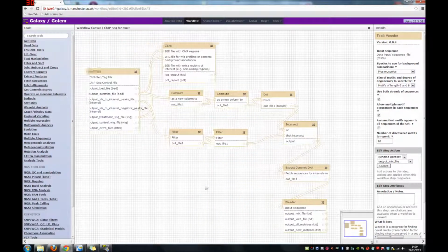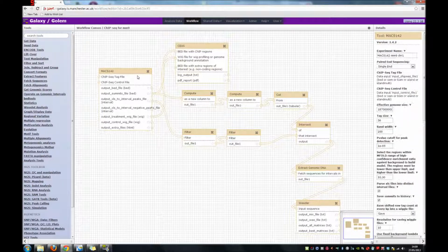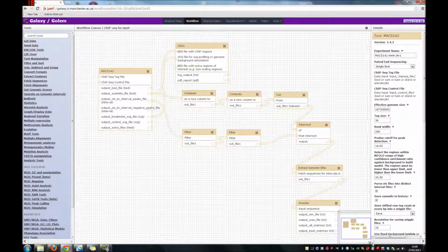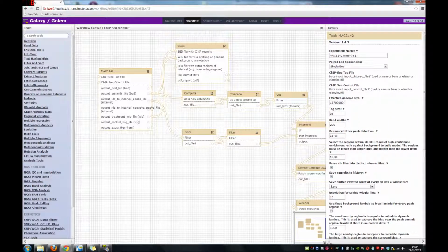So that's our pipeline. Now when you left click once on these boxes, it brings up detailed information about that task on the right hand side. Again, you can use this slider to make things wider and clearer to read.